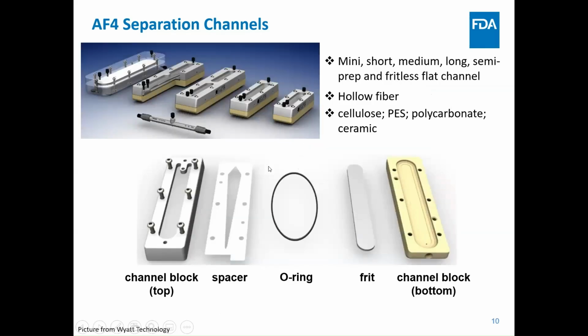And here I show you some pictures of actual channels we use for experiments. Depending on how much sample you want to load, what the purpose of the analysis is, and what resolution you want to achieve, we can choose a different type of channel.